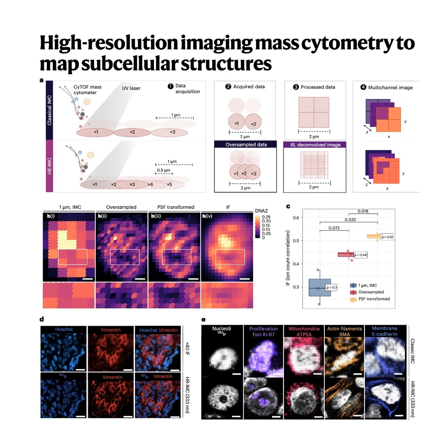So they didn't just see DNA damage, they saw that the cell's damage response was occurring exactly where the genome was most active, which suggests these immediate localized repair kinetics. It's a fundamentally new view of cell response. Absolutely. And they took this discovery capability out of the 3D culture and applied it to real native ovarian tumor tissue in situ. Mapping those same subcellular features across different cell types, tumor cells, immune cells, fibroblasts, all side by side in their natural context.